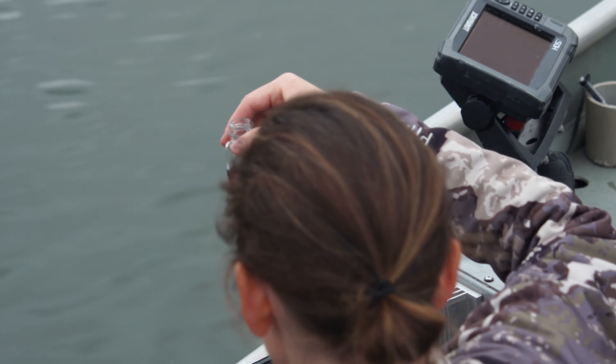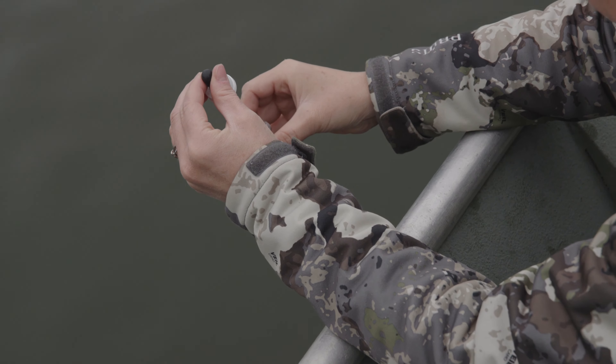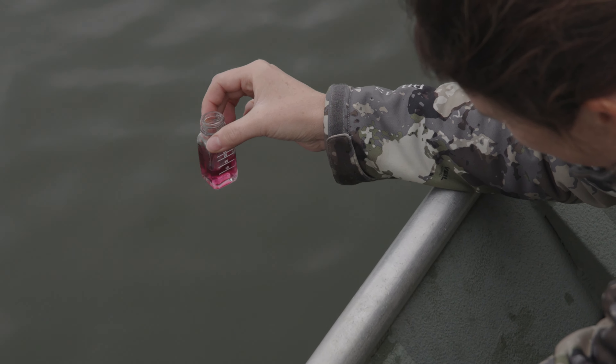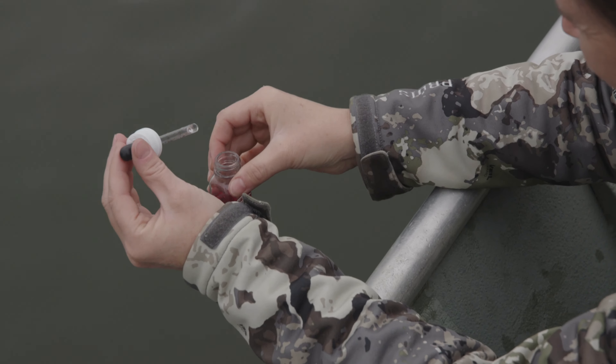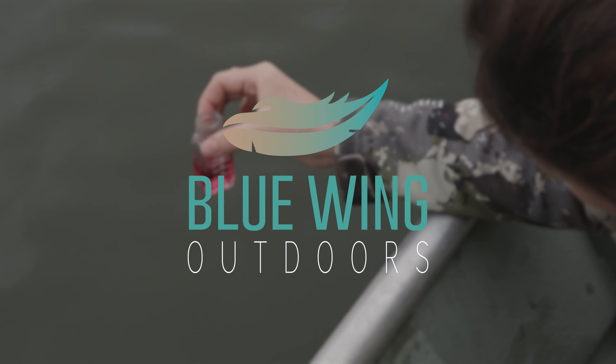A lake like this one with moderate alkalinity means that photosynthesis and all those changes that could potentially affect pH are buffered by the water's capacity to buffer it. So what are you at? 31. About two more drops and it'll turn neon pink. 32 — that's pretty pink. One more. Now we're neon pink. I'll go with your number because you're more precise. 32.